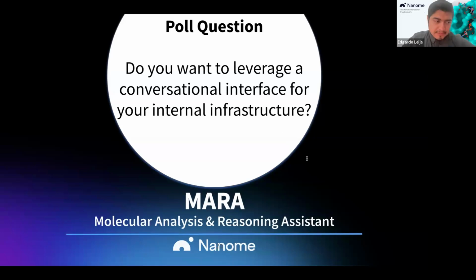It's fascinating to see, when we introduce this tool to many groups, there are so many different use cases and workflows that flush into people's minds about how they could accelerate their scientific research.